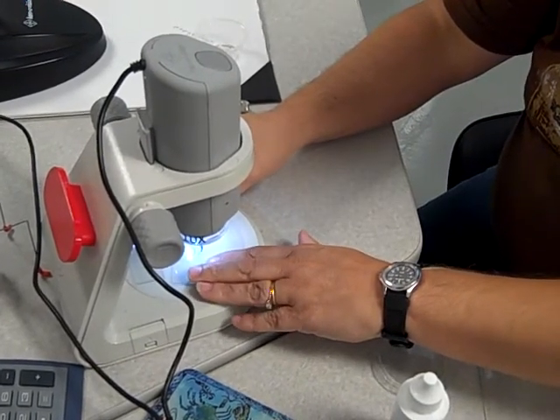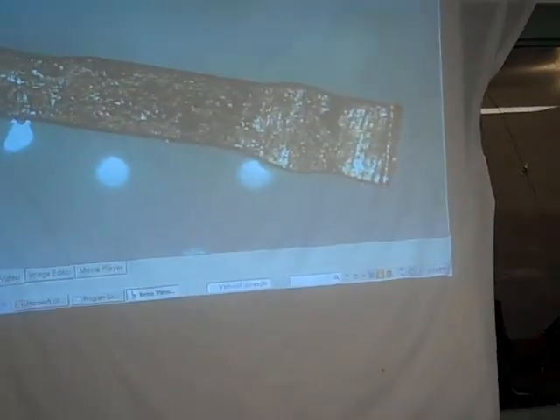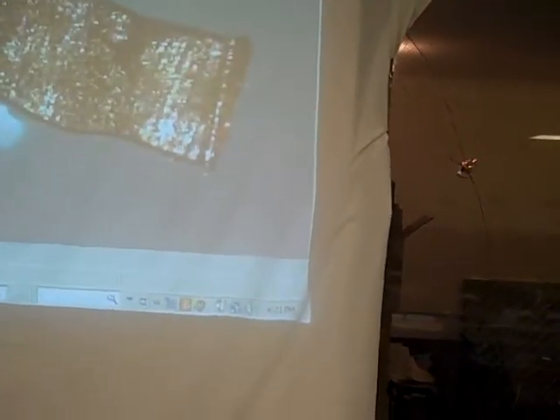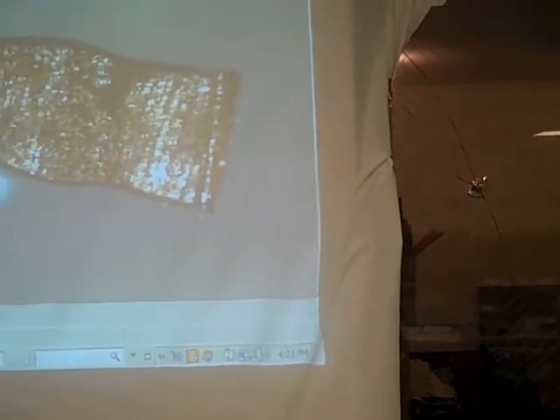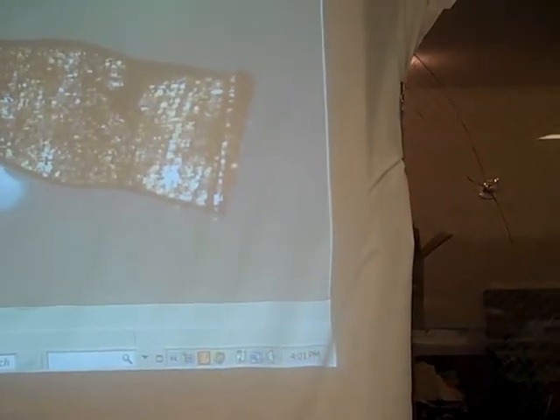That looks good. Oh, look — it's already growing. You guys see on the right edge there? See those little silver whiskers kind of sticking out the end? That's what we're looking at.